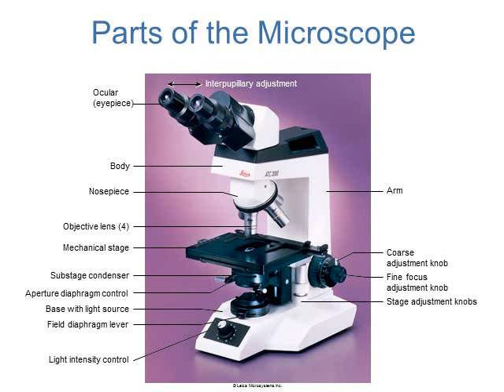You have the objective lens, and we're going to have 4 of them, including the oil immersion lens. That's the first lens your image goes through. And then the ocular lenses, those are way at the top. Those are what you look through. And again, on our microscopes, the ocular lenses are always 10x, at least the ones that we have in lab.